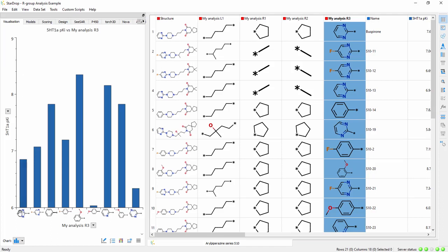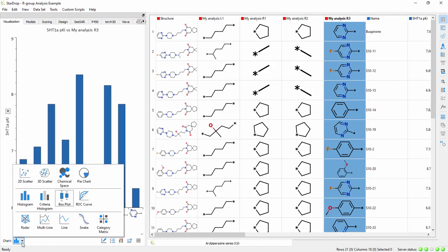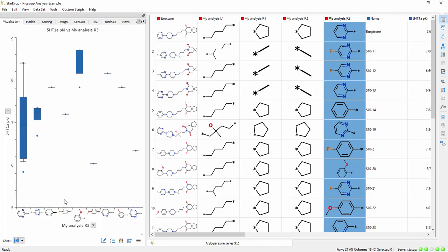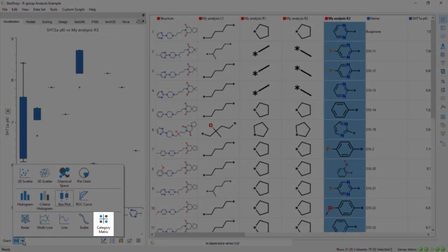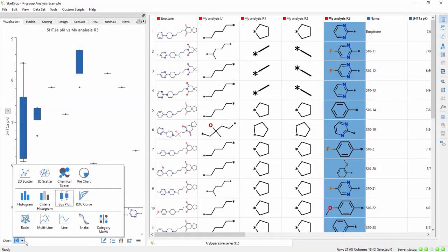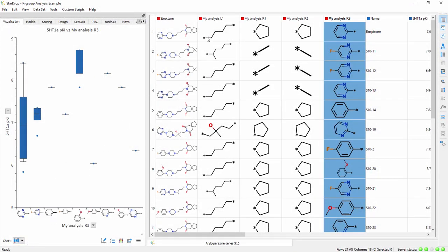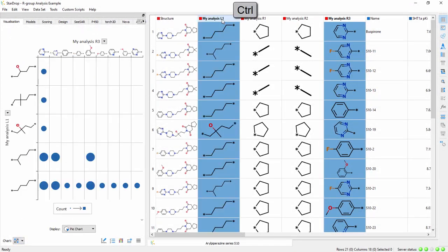Other chart types can be used to show more detailed information. SAR plots showing two points of variation can be created by choosing a Category Matrix plot, or simply selecting two fragment columns in the dataset.